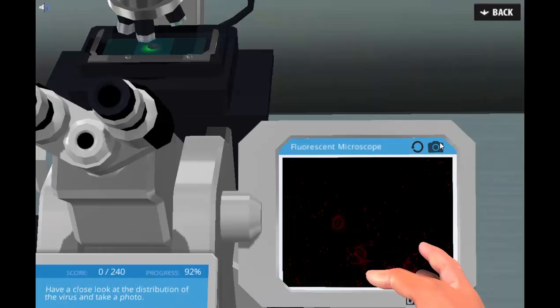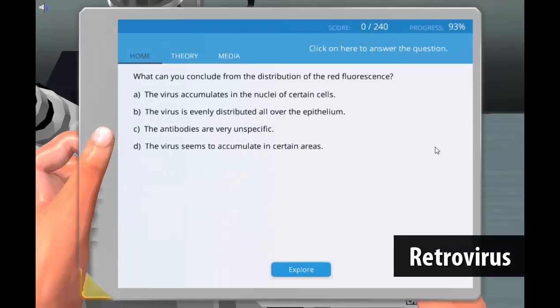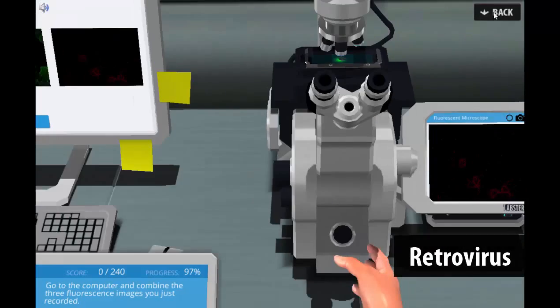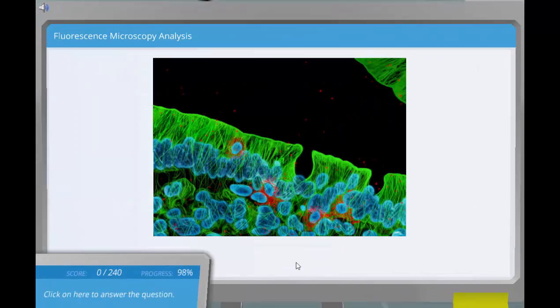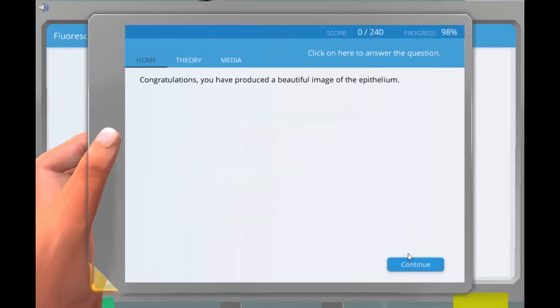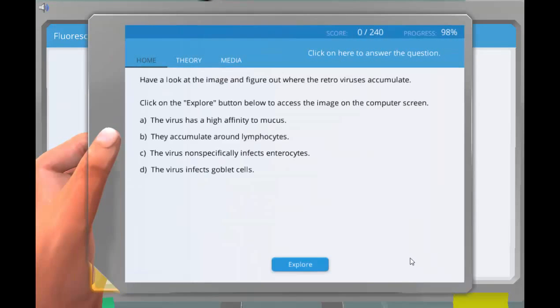In this part of the lab, students will examine a chicken intestine sample that is infected with a retrovirus. They observe how the virus infects the lymphocytes and how it inhibits inflammation. The retrovirus can be further developed as medicine for celiac disease.